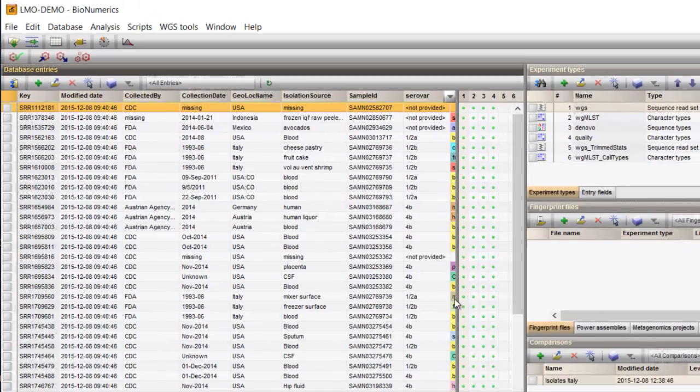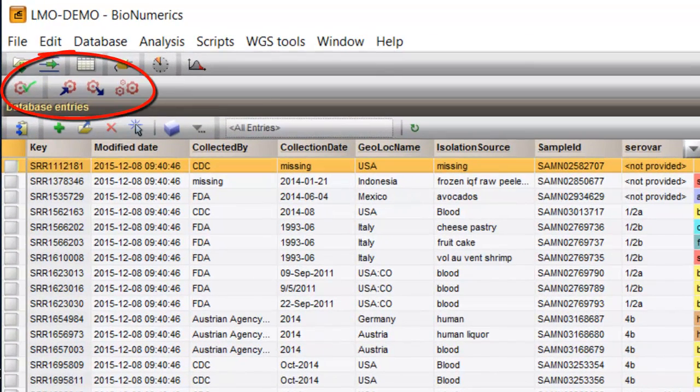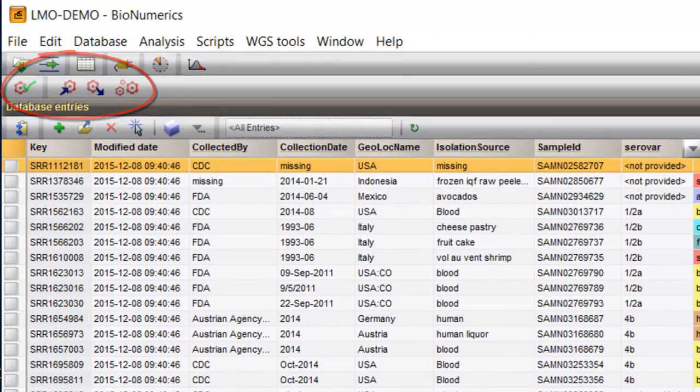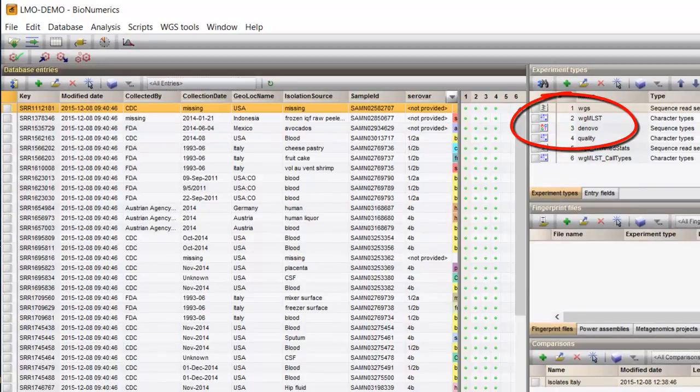Notice that these four buttons are added to the toolbar and these four experiment types are listed in the Experiments panel.